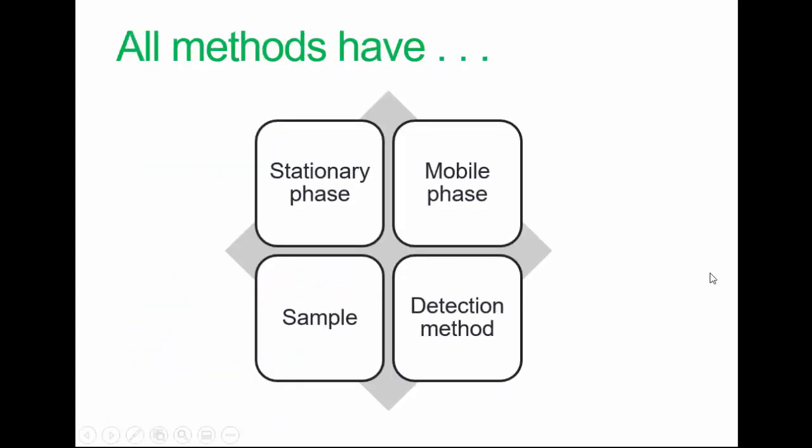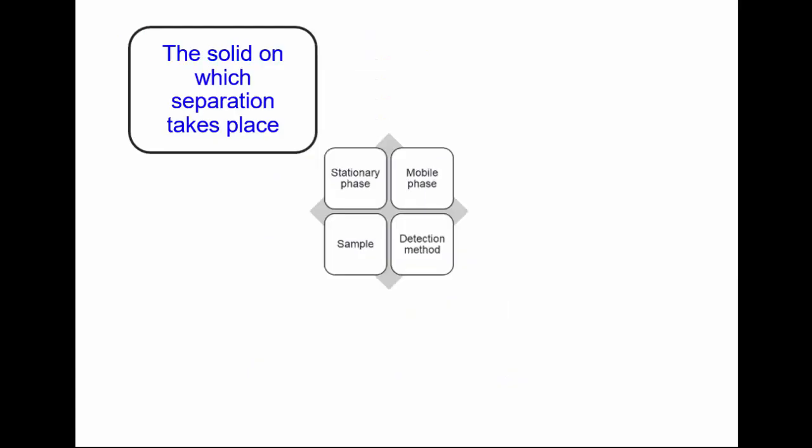Okay, moving on. All chromatographic methods have these characteristics in common. This is true from simple paper chromatographic systems to the more sophisticated hyphenated systems. For example, in paper chromatography, the stationary phase is the paper, the mobile phase is normally water, the sample might be an extract from a plant, and we detect the analytes visually, maybe making measurements with a ruler. So as an exercise, analyse HPLC on this basis. What are the relevant factors based on this analysis?